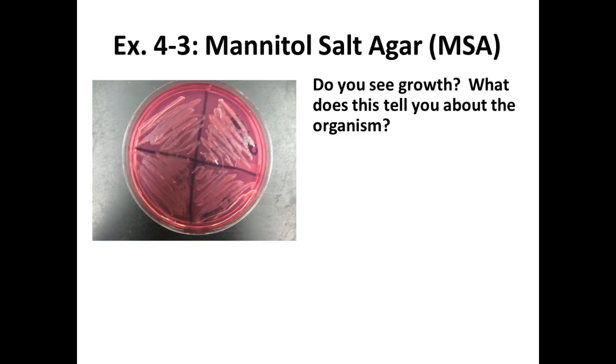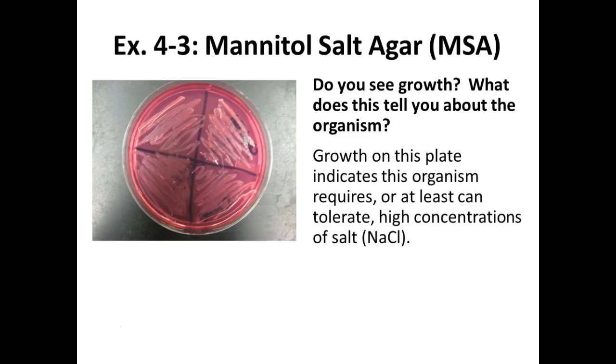the mannitol. So we know it's salt tolerant, right? And it's a non-fermenter of mannitol. Everyone agree with me on that? It could be a Staphylococci, right? And in fact, I know what was put on this plate. This was Staphylococcus epidermidis, right? So this one, unlike aureus, does not ferment the mannitol, right? But it will grow. It is a staph.